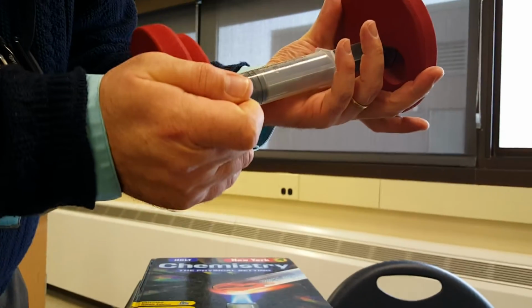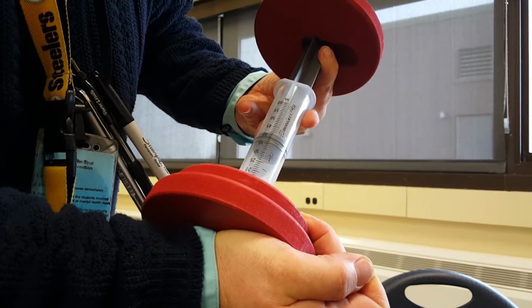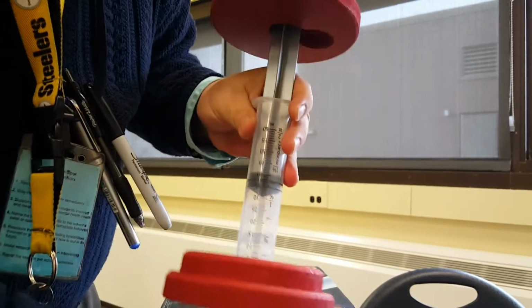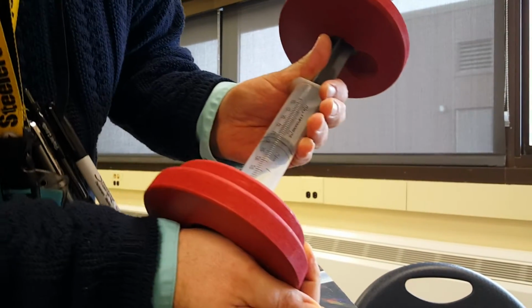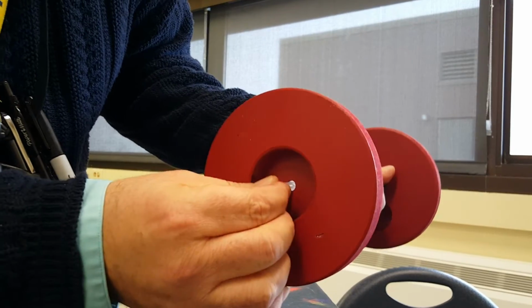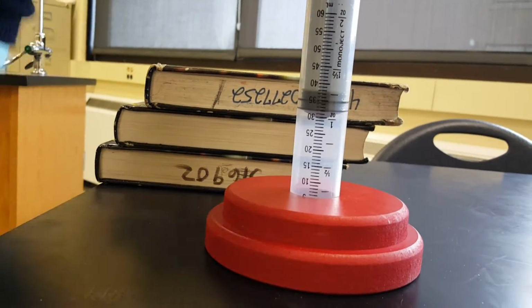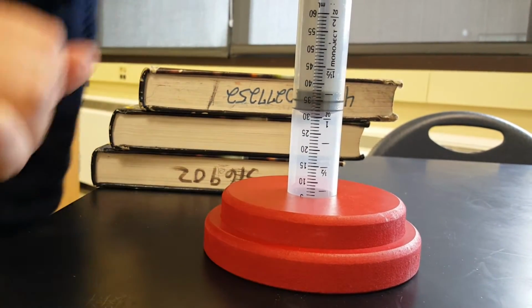So what we're going to do for this lab is set this thing to a known value. I think 50 worked last year. I think it was 35 is what we did, just for stability purposes. I think that'll work fine. But here's the trick: I'm going to set it for just a smidgen above 35, and I'm going to cap it. Then I'm going to give it a little push to make sure that it's working. Right, and now look, I started at like 32. That's okay, so there's my starting volume.